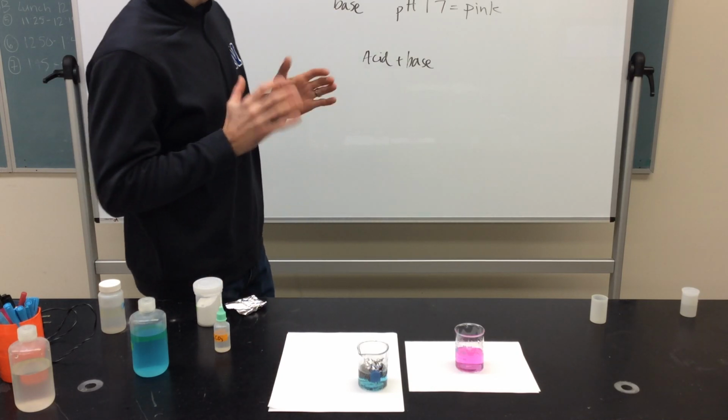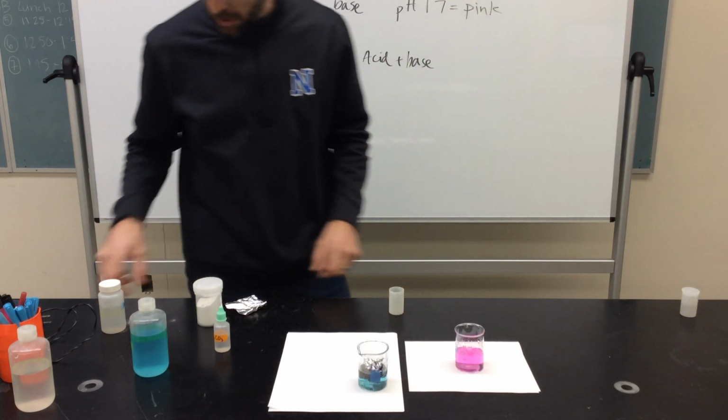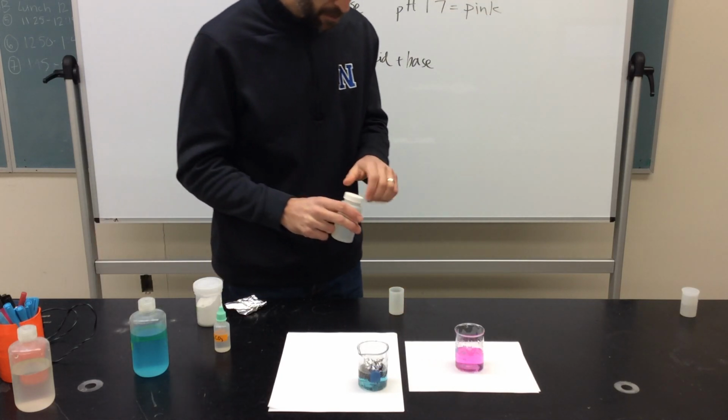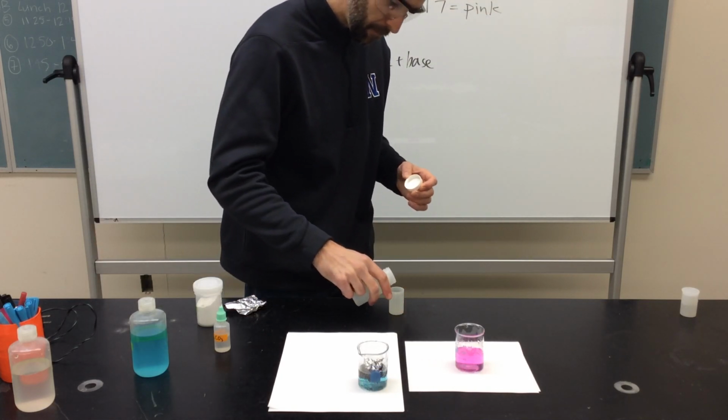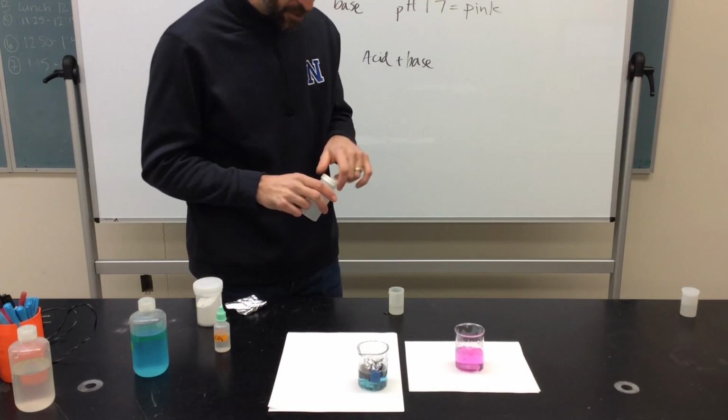So we have one more experiment that we want to look at really quickly here. And in this experiment, we're going to take some acetic acid. We're going to put it in this little container right here.